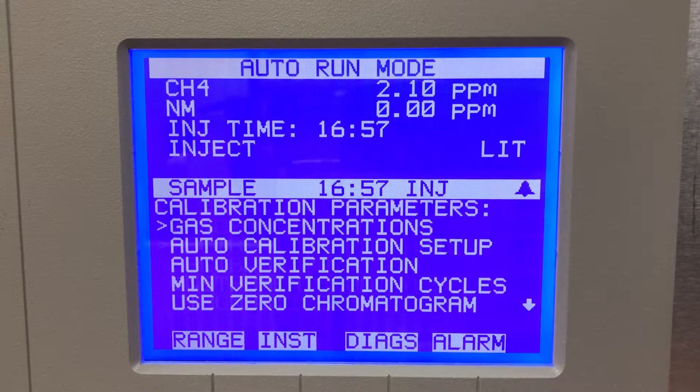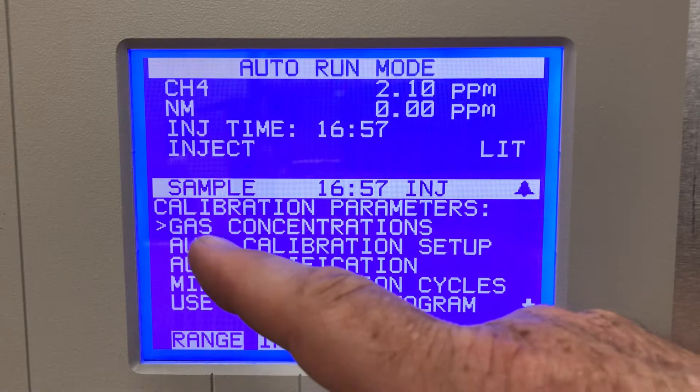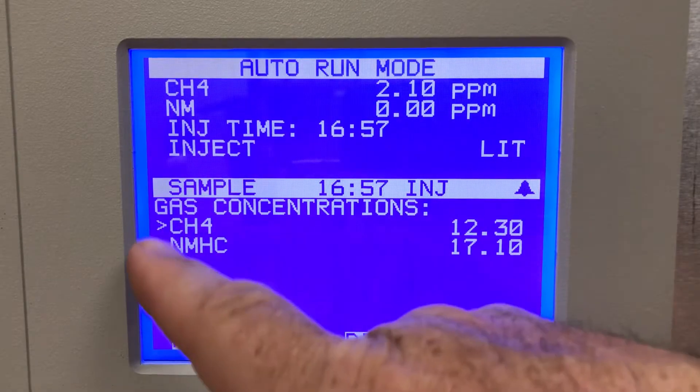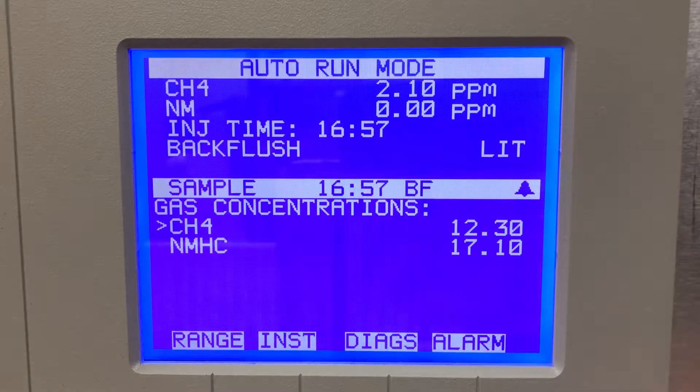Calibration parameters — here's where I would go in and set my cal gas concentrations. Gas concentrations for calibration: I would go in here and set my methane and non-methane. 12.3 and 17.1 are my high points, so I would have to save these in here first before beginning my calibration.